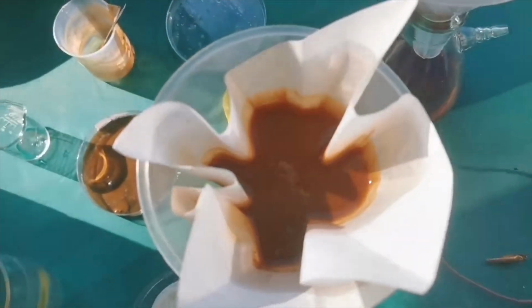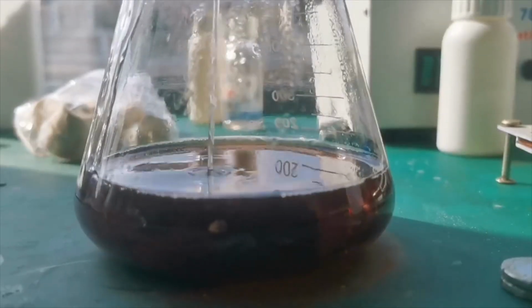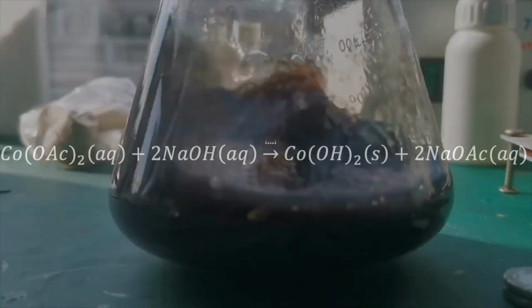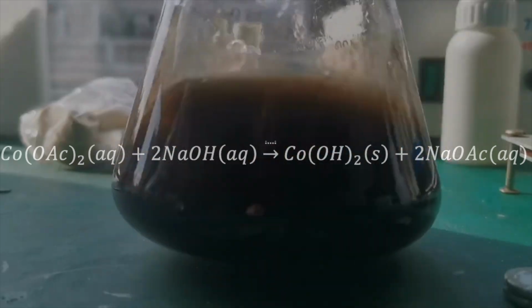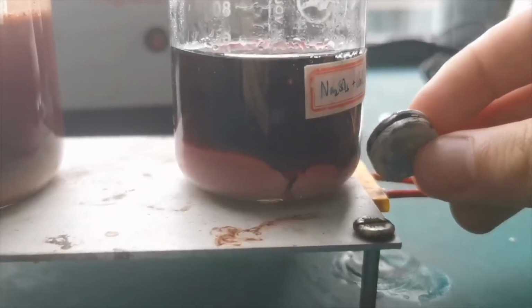that I added before. I then weighed out around 10 grams of sodium hydroxide, dissolved it in water, and added it to the filtrate. A blue-black precipitate immediately appeared, which is pure cobalt hydroxide. Back to the hydrochloric acid solution.